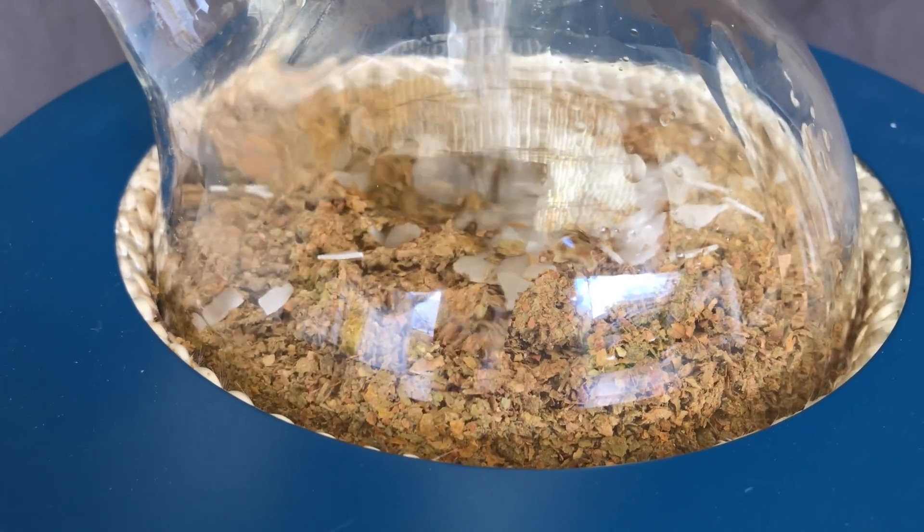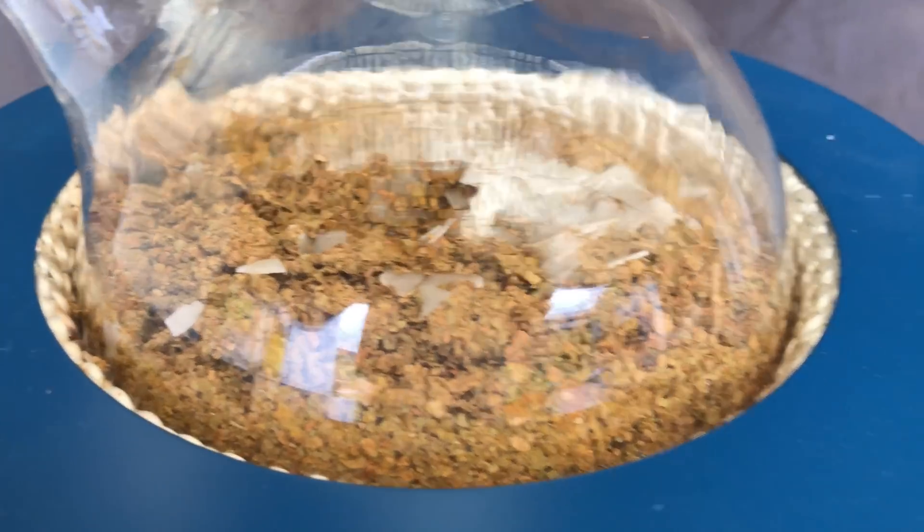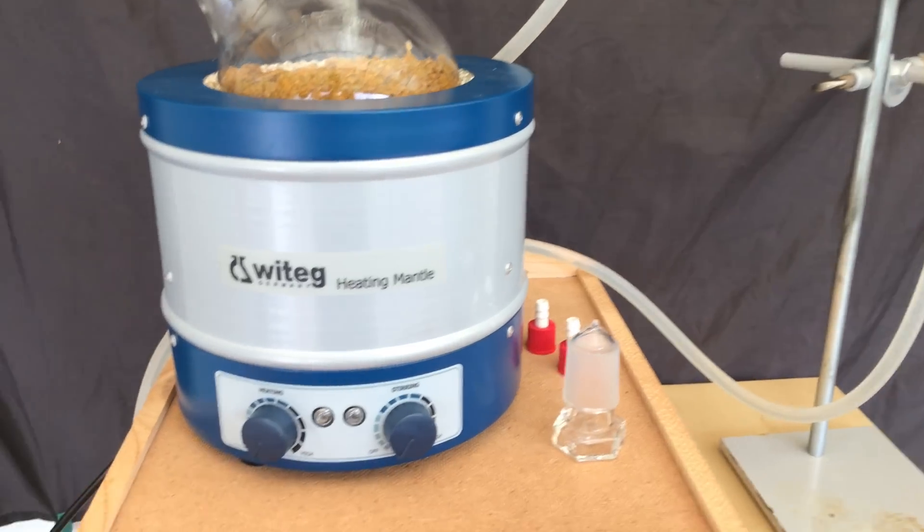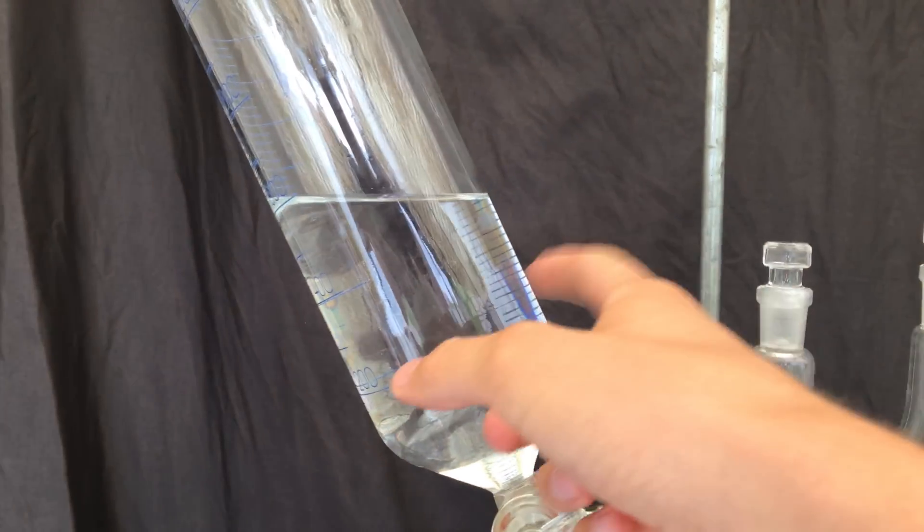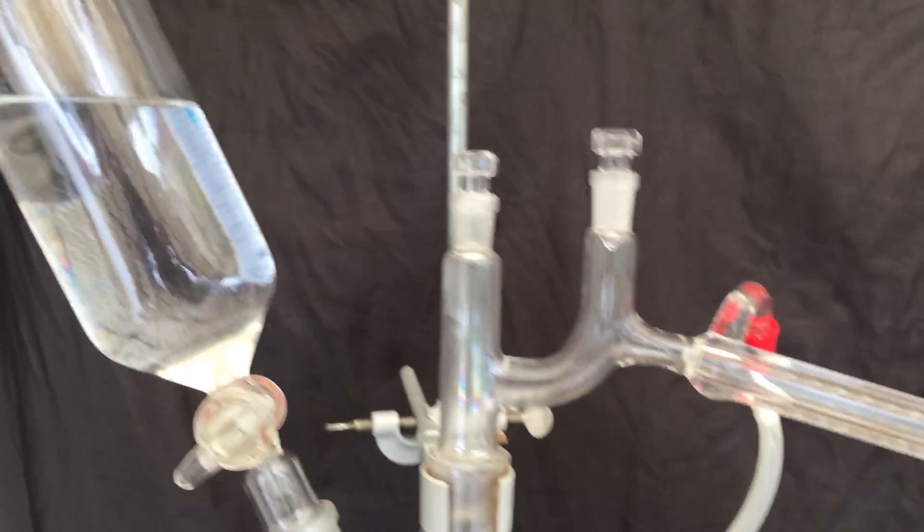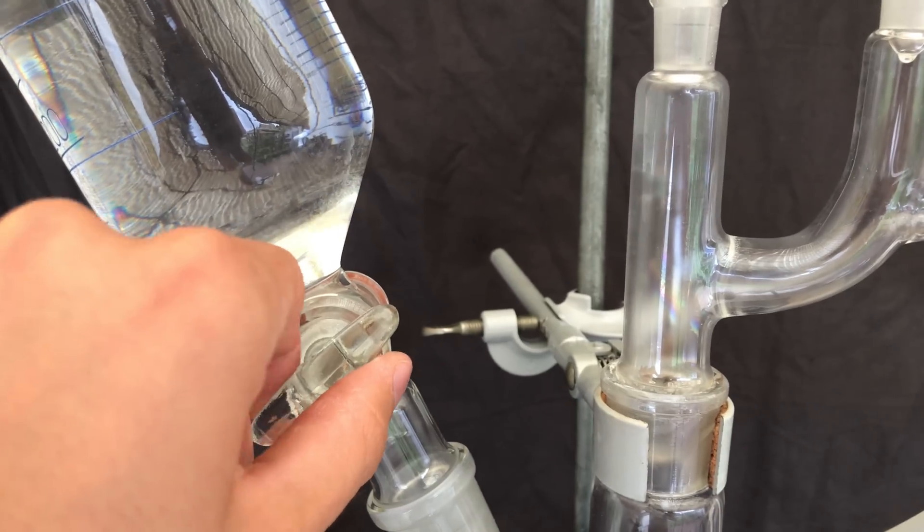Nicotine has a boiling point of about 250 degrees Celsius, which is relatively high. With the help of steam distillation, the high boiling yet volatile nicotine is carried over by the water vapor, drastically lowering the required temperature.